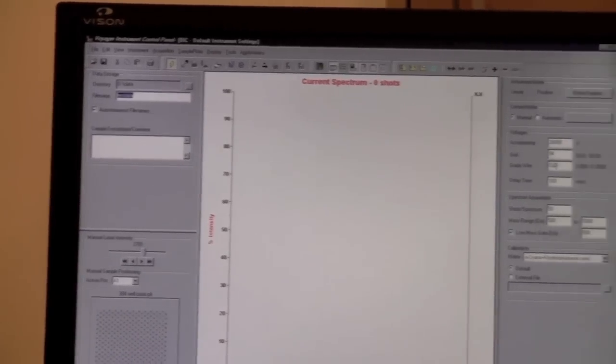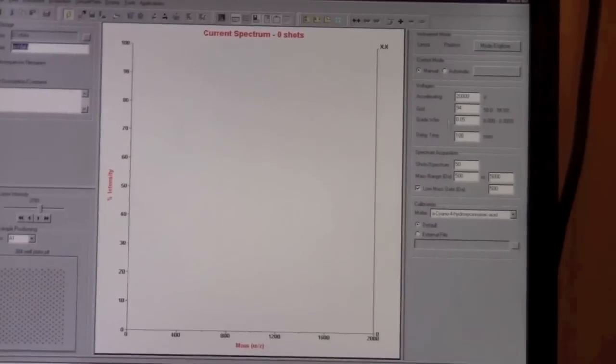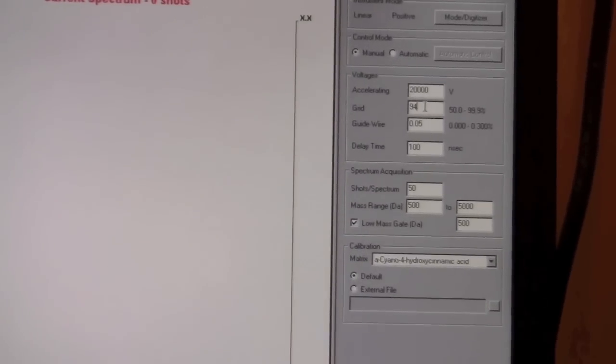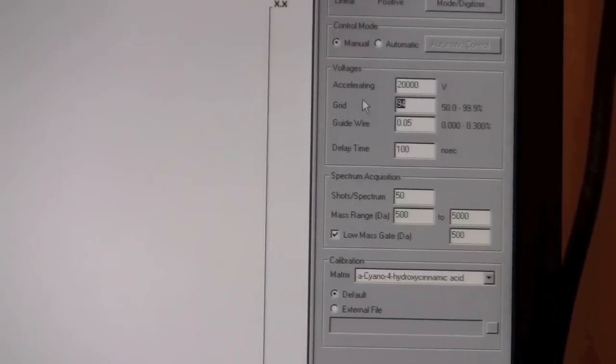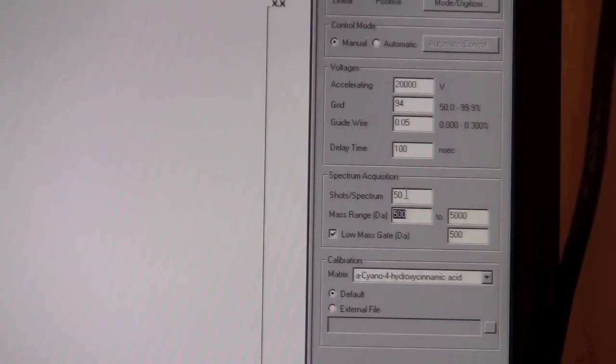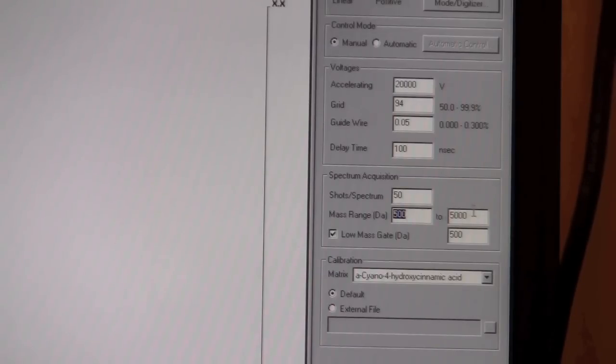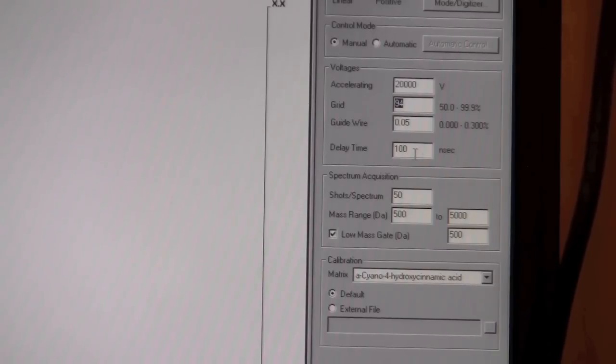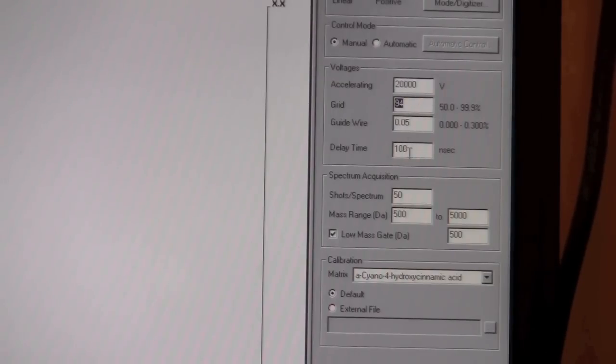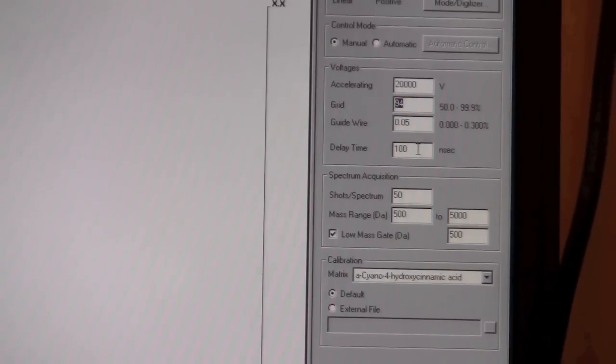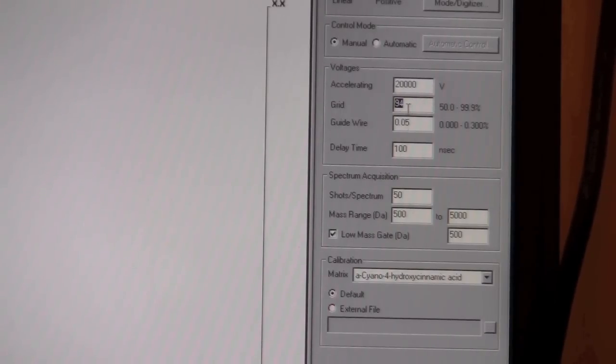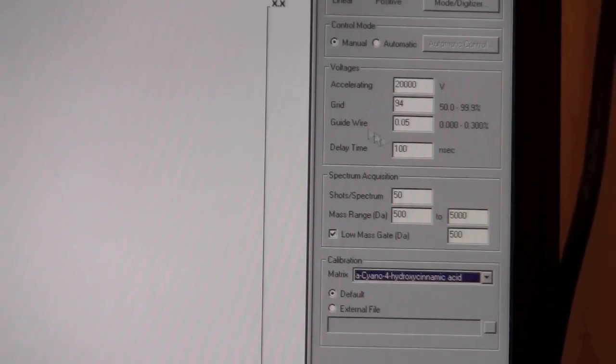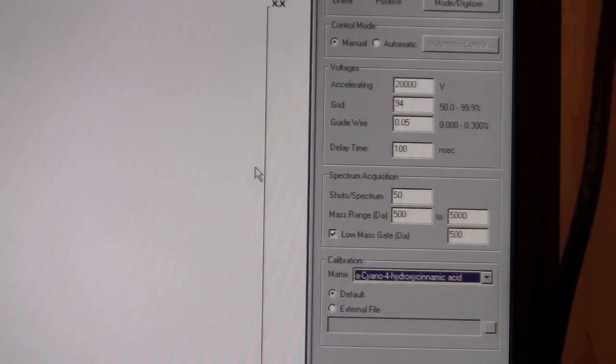Next you want to look at these parameters on the right hand side over here. The main parameters you want to look at are the grid percentage and the delay time. Also, you can look at the mass range and the number of shots per spectrum. Depending on the mass range you're looking at, you'll need to adjust the grid and delay time. These will vary from sample to sample and you may need to try a number of different settings in order to get optimum settings for your sample. Also, be aware that to get the best signal to noise, you should use fresh matrix and use the proper techniques to integrate the matrix with your sample. Down here, you can select a calibration file depending on what matrix you're using.